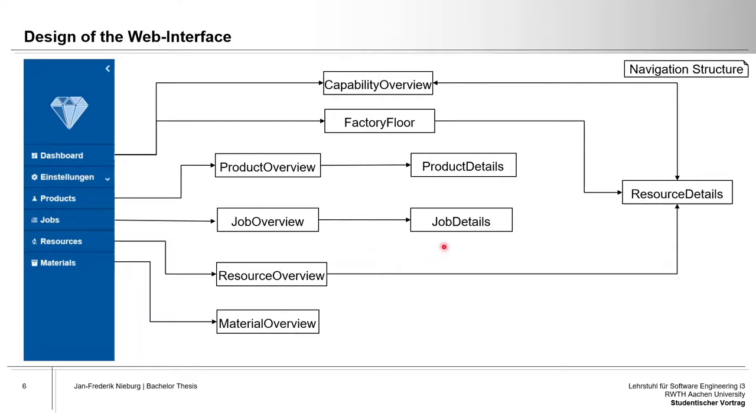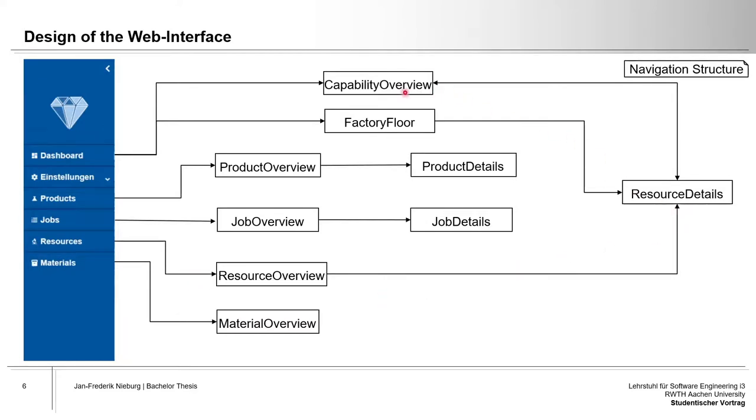The details pages for resources, products and jobs are accessible through overviews, which contain lists of all objects in the system. The resources can alternatively be accessed through a factory floor graphic and through a list of capabilities. Next, a selection of these pages will be shown as examples.